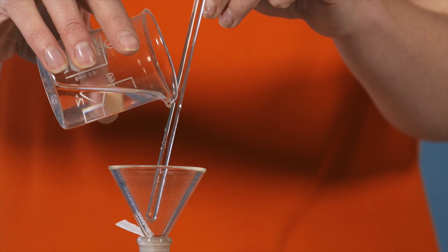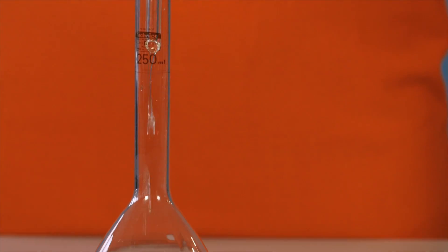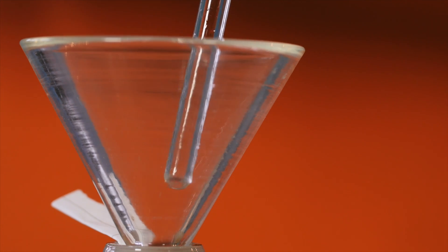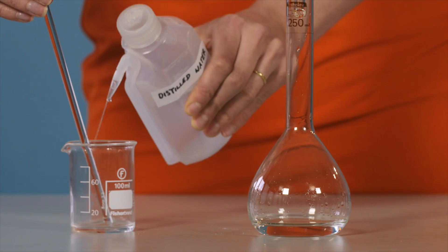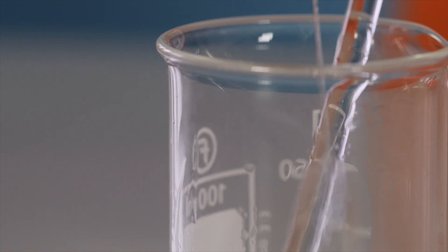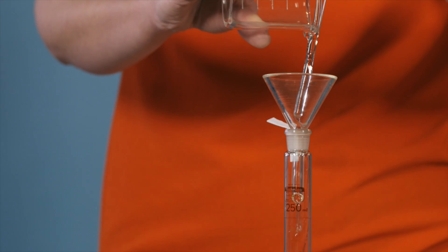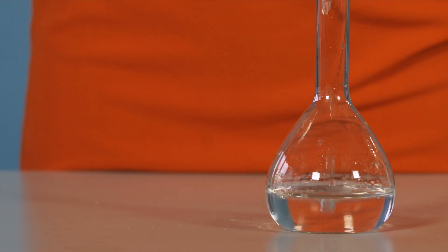For the next step, you'll need a 250 centimetre cubed volumetric flask and a funnel. Pour your solution down a glass rod and through the funnel into the flask. Make sure to raise the funnel so that it drains smoothly. To make sure all of your sodium carbonate solution is transferred to the volumetric flask, use a wash bottle to rinse the beaker. Make sure to add this rinse to the volumetric flask each time and do this at least three times.